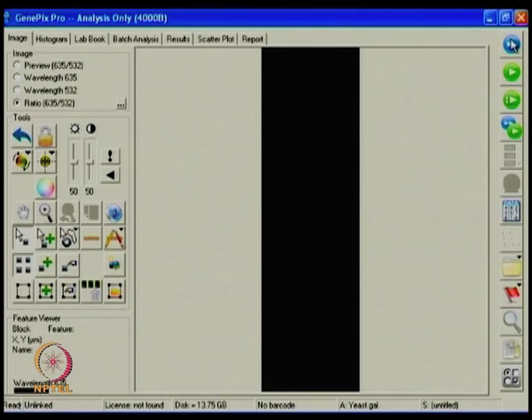So the first one is a preview scan, and then you can also have a data scan. One stands for one wavelength, so it allows you to take an image from only one wavelength. And then you also have multiple scans, so you do a preview scan, then you do a scan with this button. You also have other buttons which will light up as and when you acquire the image, and this is for the analysis. So once the analysis is done, if you click this button, the analysis will be performed after the alignment.